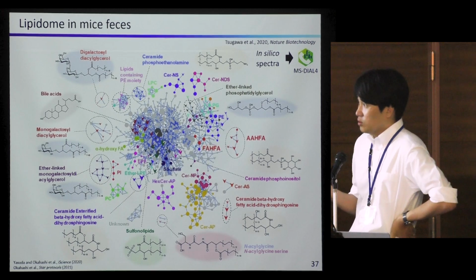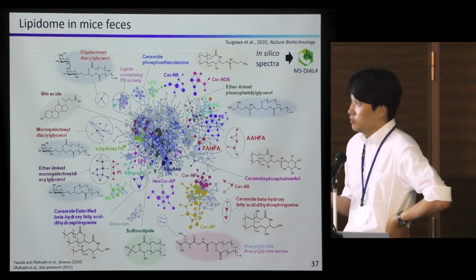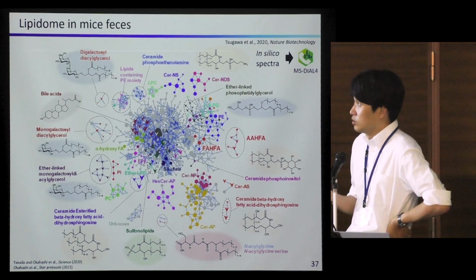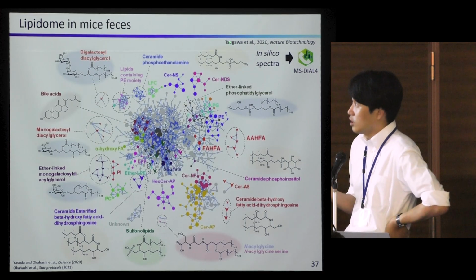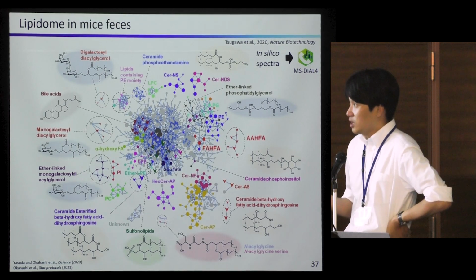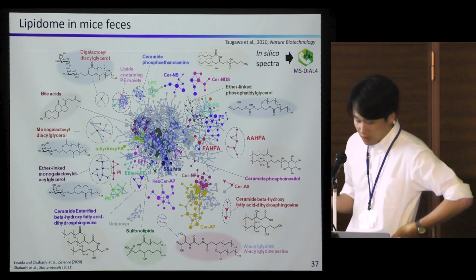So generally we cannot validate the structure, but we included these MS/MS spectral data into the very famous lipidomics software in collaboration with Dr. Tsugawa. And now everybody can use this method, and you can identify these molecules. And this process is explained in this paper.